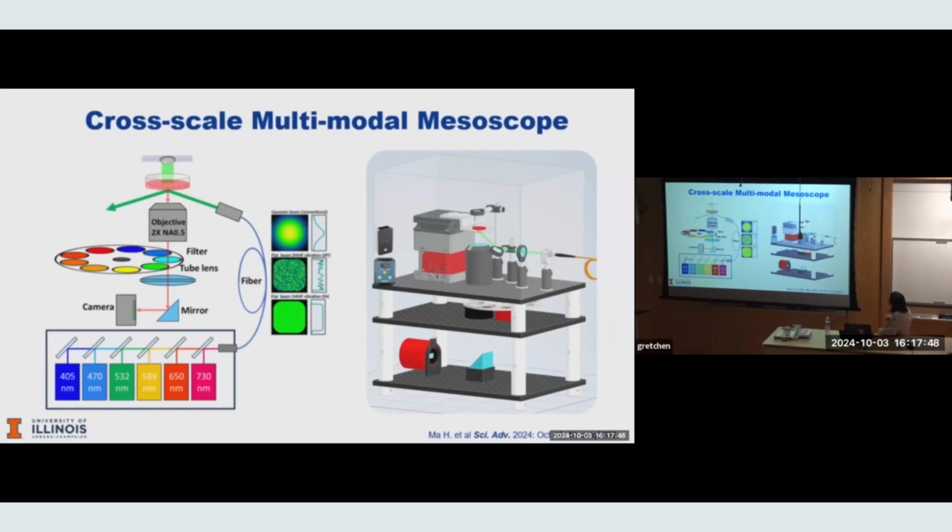It has a very large sensor and small pixel size, coupled with a bigger lens that people use for stereoscopes. When we couple it with the right sampling and pixel size, the NA here is 0.5, which is one of the highest NAs we can find off the shelf. We built this system with the goal of getting as large a field of view as possible with the highest possible resolution.